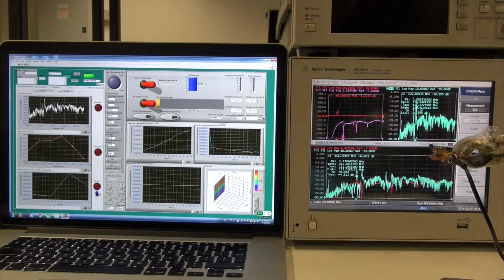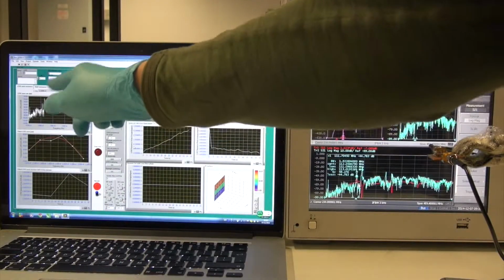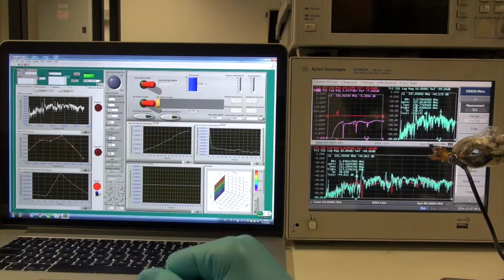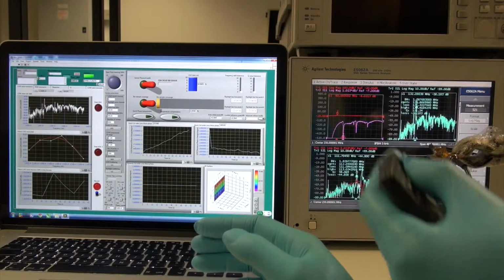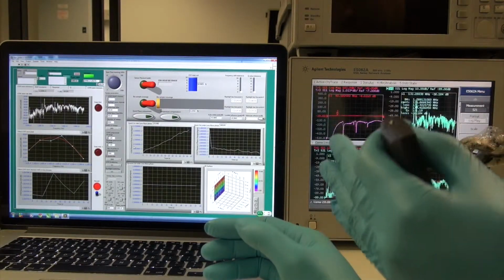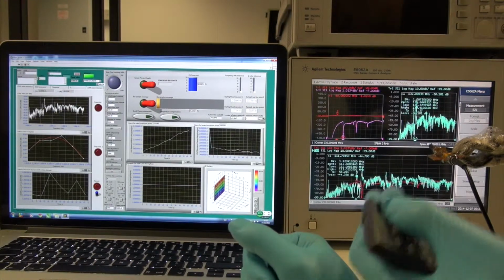In the last section, we will introduce the quick measurement function, because after the device data fitting and data processing are automatically executed here, and also the device diagnosis here, we don't need to do any frequency sweep, because we already know where the specific resonance frequency is for the specific device. So we can go to a much quicker measurement without sweeping the device, which can increase the measurement speed a lot.